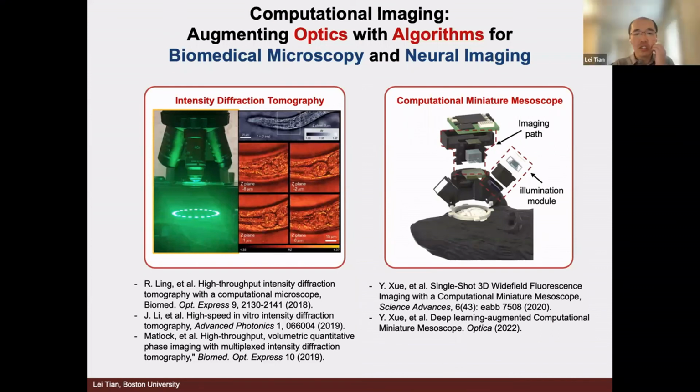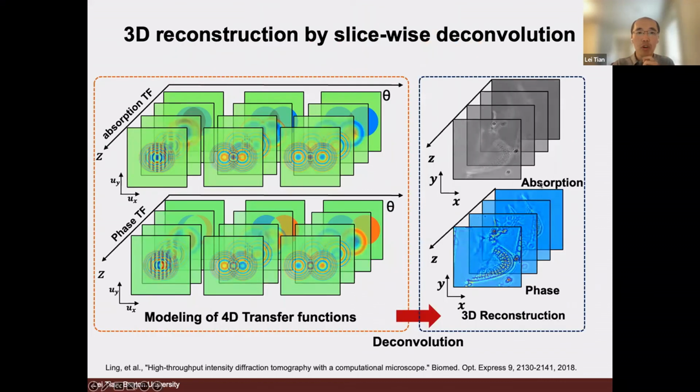Right. Yeah. So I'll comment on a few things. One is about the absorption. It's not necessarily in order, I'll just jump onto whatever comes to mind. In principle, the algorithm, and by the way, this is all open source, but feel free to email me if you need guidance on how to implement this. The algorithm itself spits out both intensity and phase.